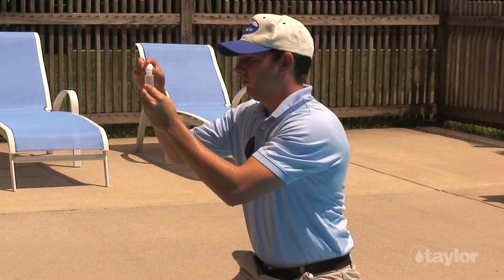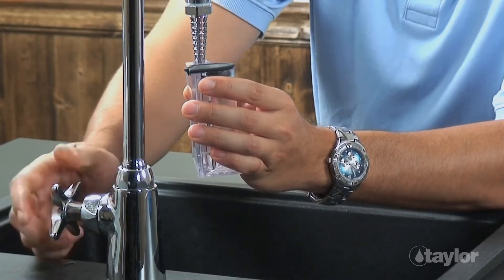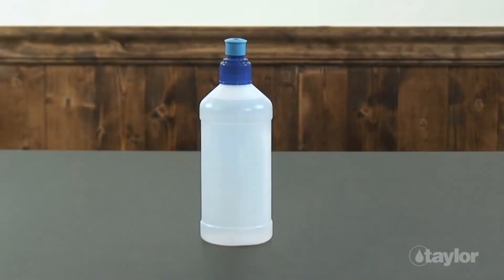To avoid cross contamination, remember to rinse all sample containers and caps between tests. Do not dispose of treated water in the pool or spa. It may be more convenient to fill a sample bottle once than to fill test tubes several times at poolside.